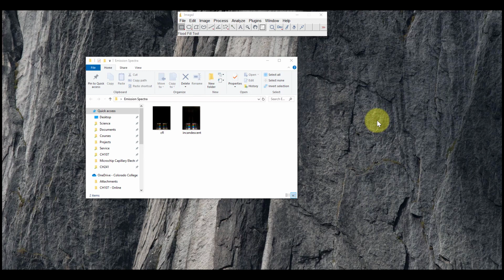If you haven't already, you're going to want to download that. There's a link to how to download this. It's freeware. This comes from the National Institutes of Health. It's really powerful open source software package that is used in virtually every field of science. I use this throughout my graduate school career. I use it currently for my research. It's a really nice tool to get familiar with. Really simple to use, but has powerful tools, especially for image processing.